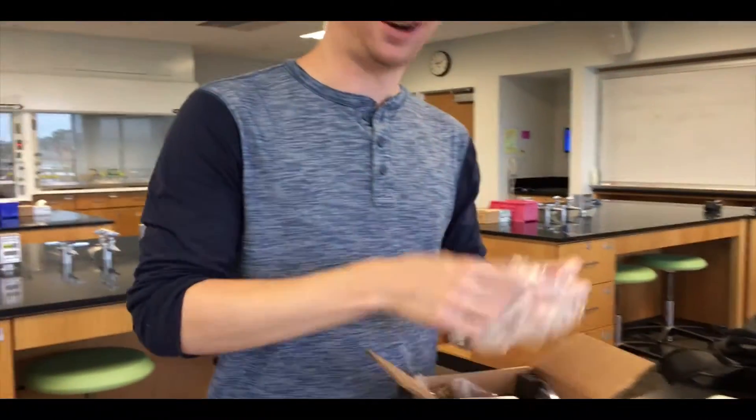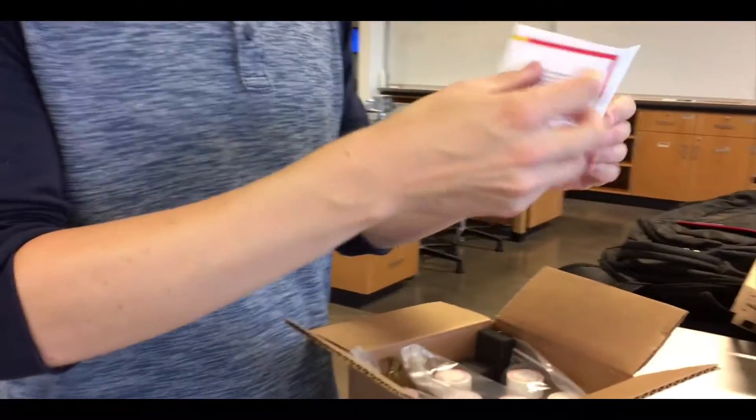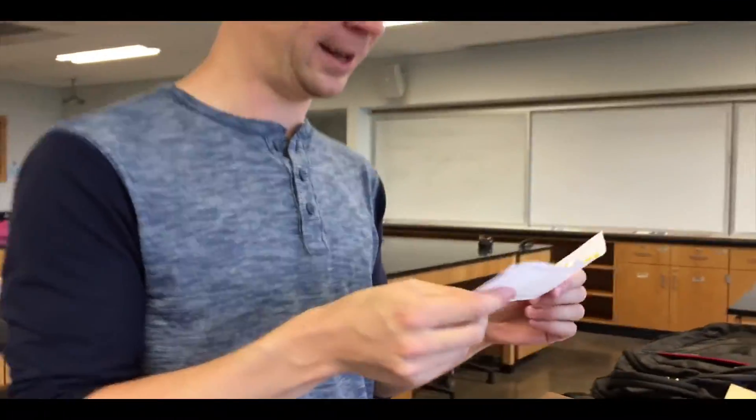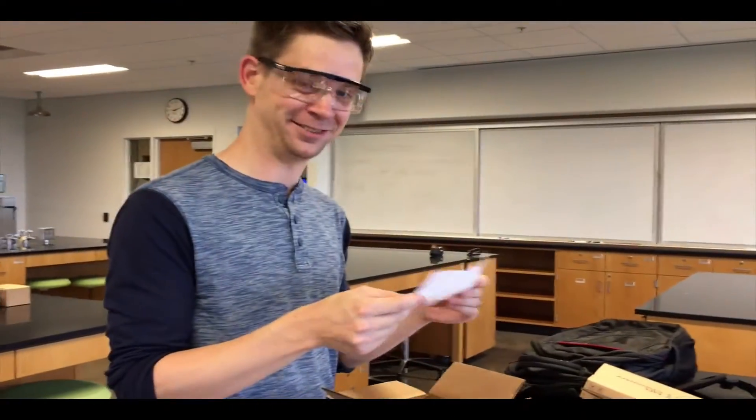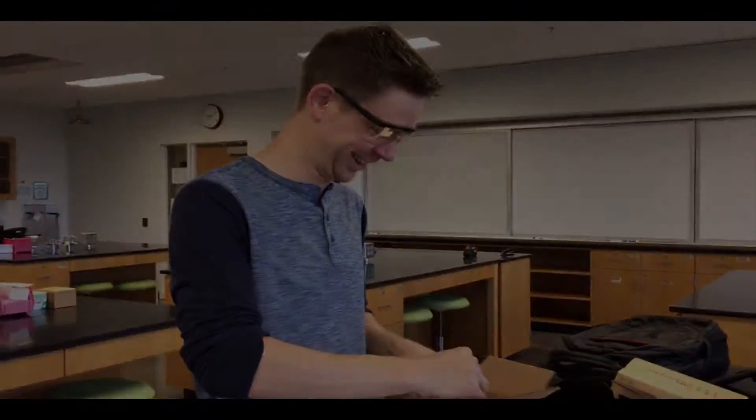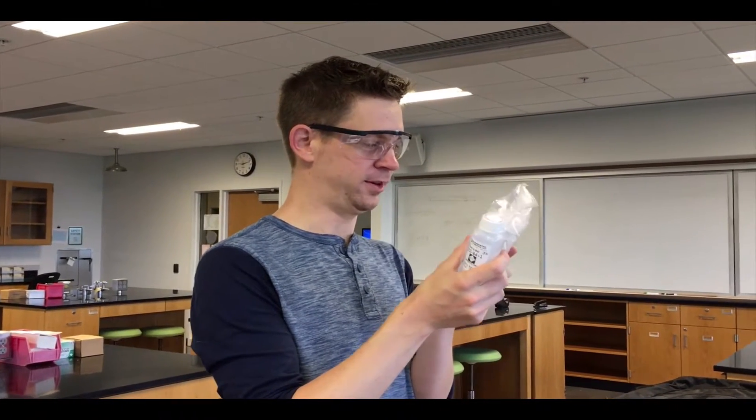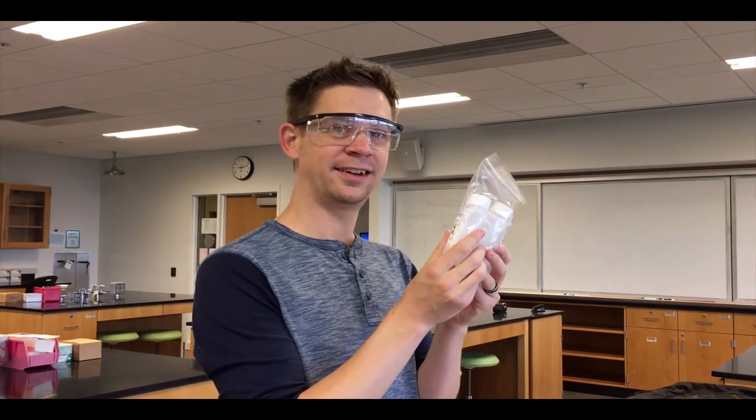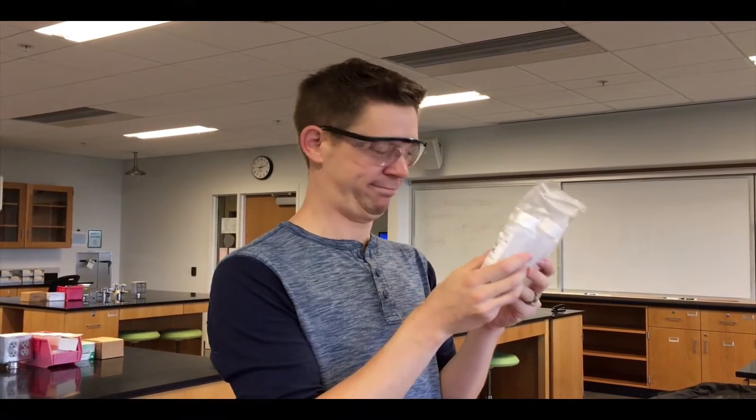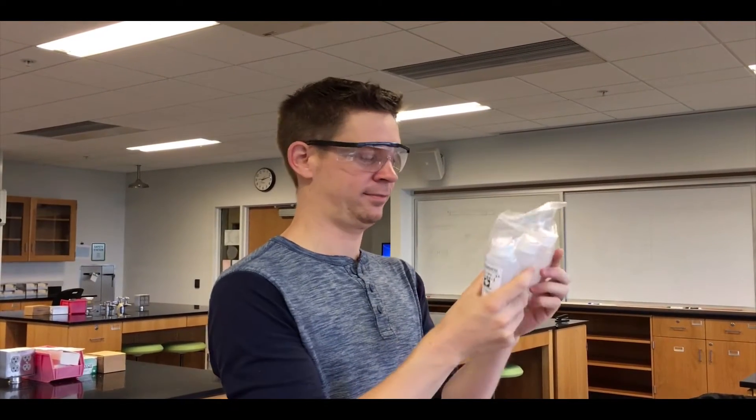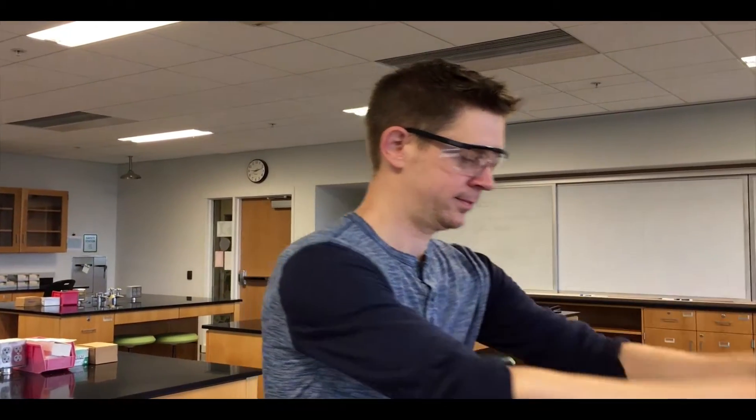Who needs it? Oh, this is all the chemicals. MEL Lab Store, Little Canada, Minnesota. You know that was a town, Little Canada. You don't see normal very often, that's interesting. Well, hydrogen hydrochloric acid normal and molar is the same, that's right. Hydrogen peroxide three percent. Three percent, how much is the stuff you didn't store? Just similar to that, the drugs. Yeah, three percent.